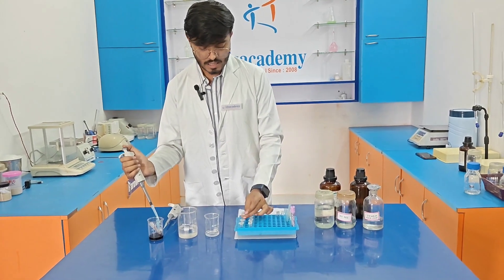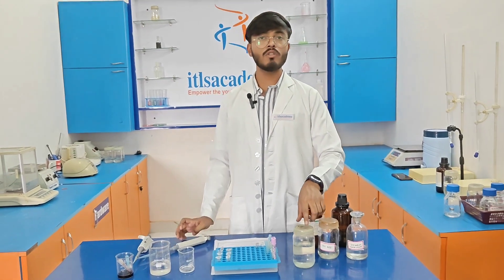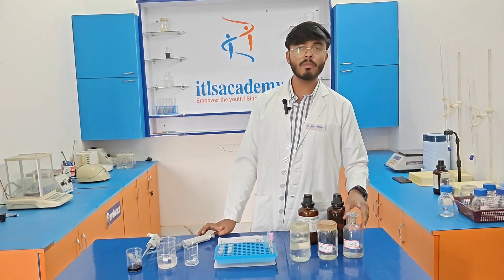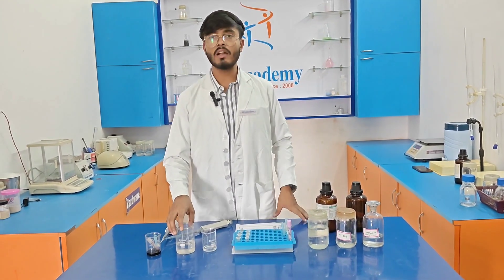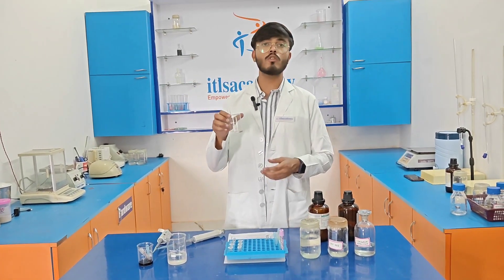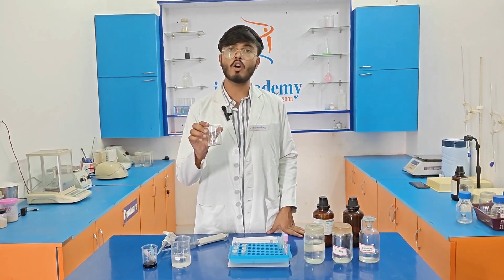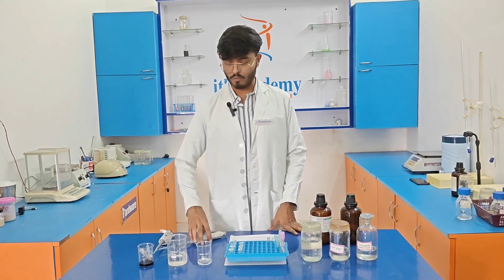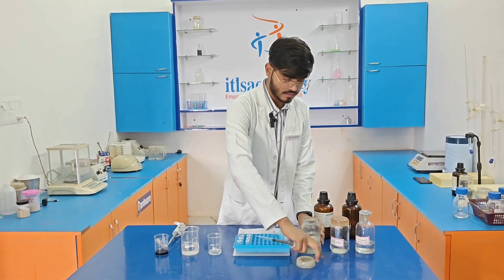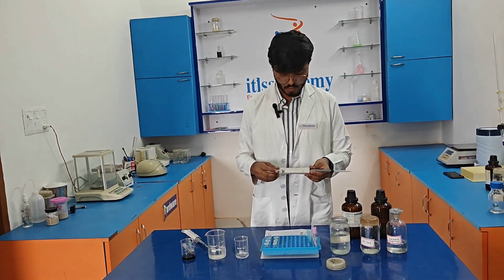After discarding the supernatant from each eppendorf, we need to add the following reagents: 100 µl of protease buffer, 10 µl of 10% SDS solution, 120 µl of NaCl solution, 300 µl of distilled water, and 400 µl of a mixture of chloroform and phenol. For preparing the phenol-chloroform mixture, we add 4 ml of phenol and 1 ml of chloroform. Now I am adding 100 µl of protease buffer.